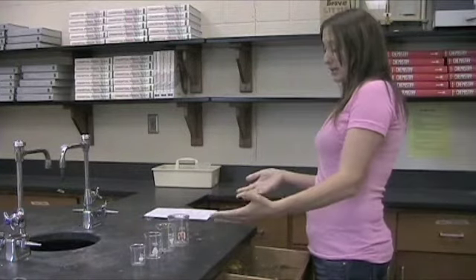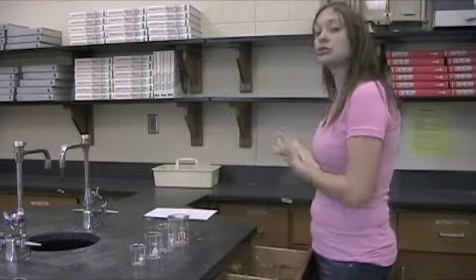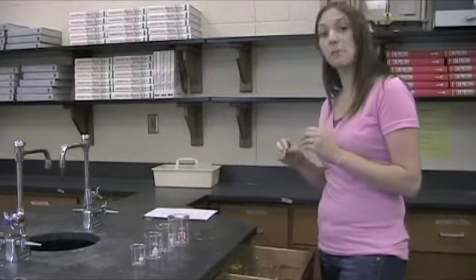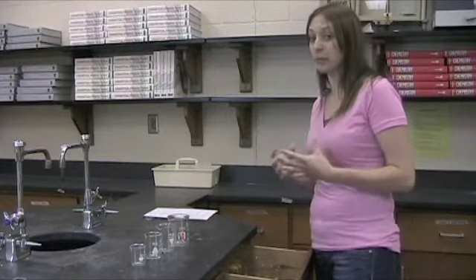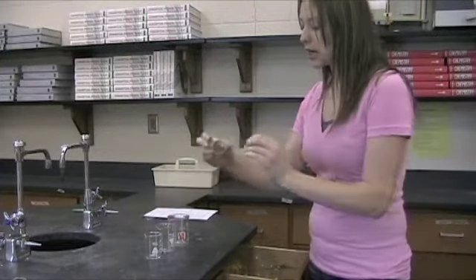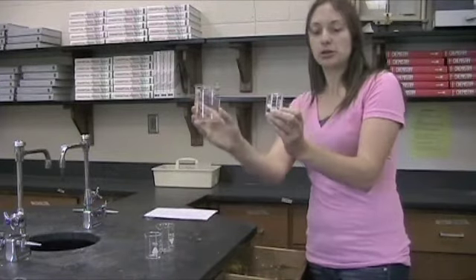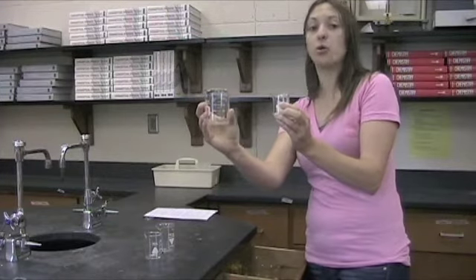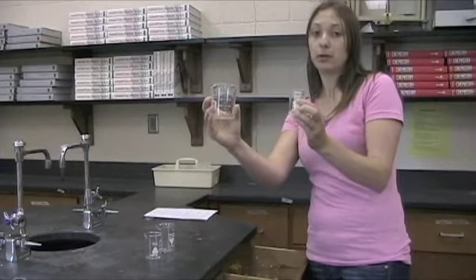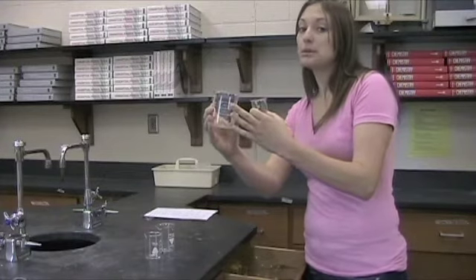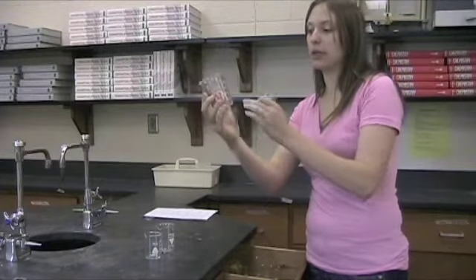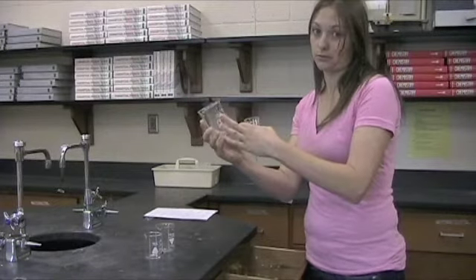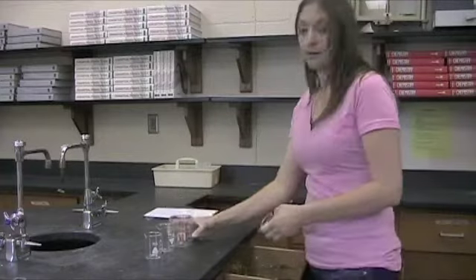There are many different sizes of beakers as you can see and there are ones that are much larger than these. Beakers are very good estimates of volume but they are not very precise. They'll give you just a very general 20 milliliters. What you'll see on a beaker is little graduations and then in the upper left hand corner you'll see actually how much it can hold. So all the way to the top will be 250 milliliters on this one. A lot of times people will say to me, Ms. Butts, I only have a 200 milliliter beaker. Well actually you have a 250. They just don't go all the way up to the side. So that is a beaker.